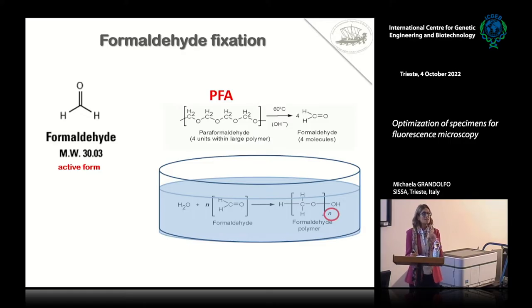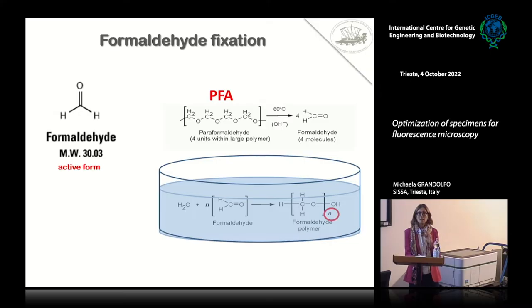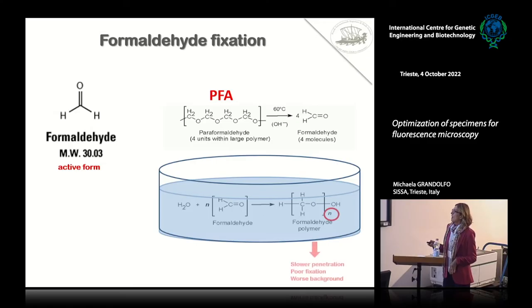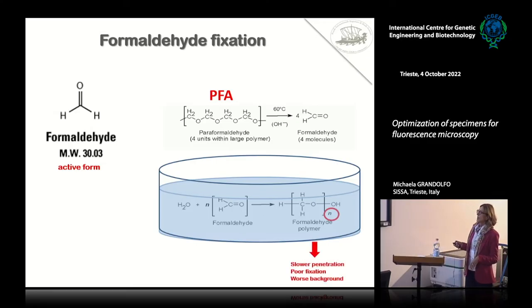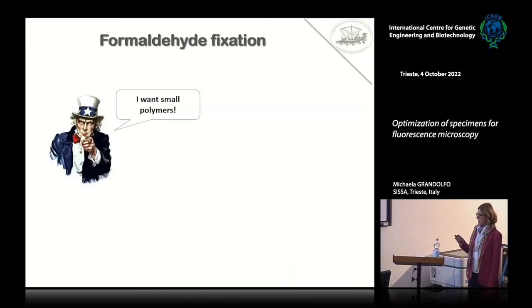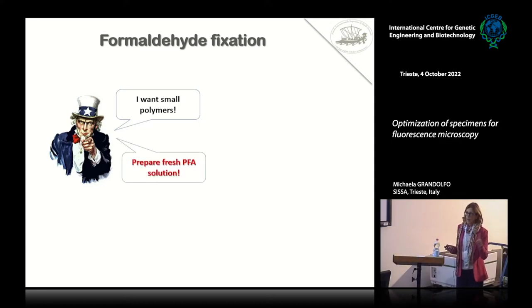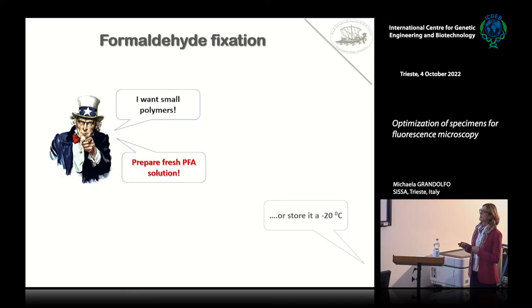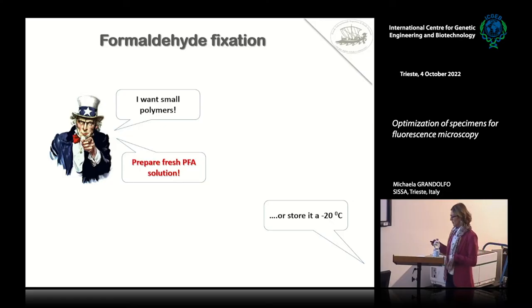Do not leave it on the shelf, do not leave it in the fridge. This is absolutely compulsory if you need to work with animals and perfuse them, otherwise the quality of your tissue will be absolutely horrible. Remember that if you have polymers, you will have slower penetration, poorer fixation, and even worse background in your tissue or sections. If you know you don't have time to prepare fresh PFA, prepare it in advance and then store it at -20°C, which preserves the single active forms.